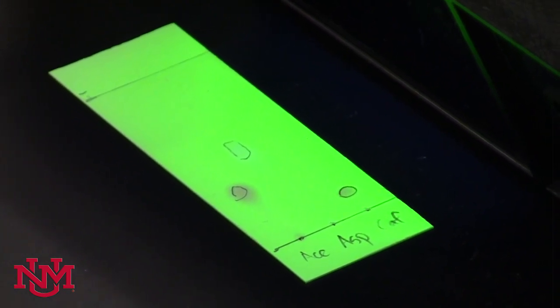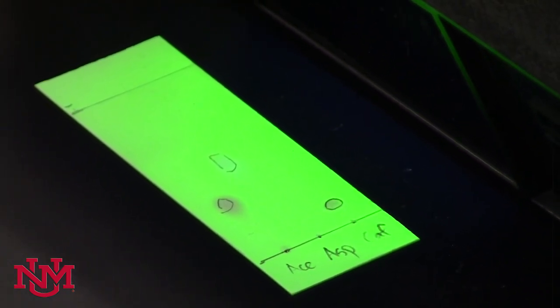Your teaching assistant will discuss how to calculate the retention factor or RF values in order to interpret the rest of the plate and compare it with your samples.